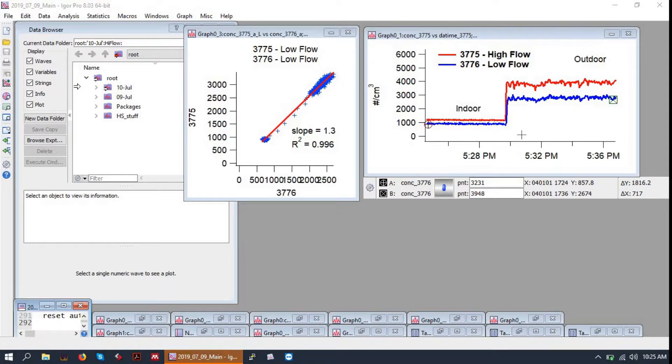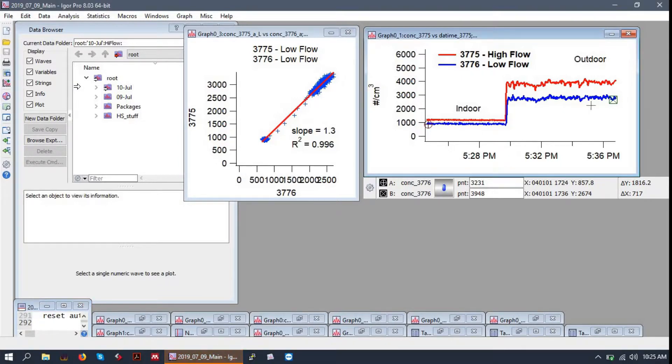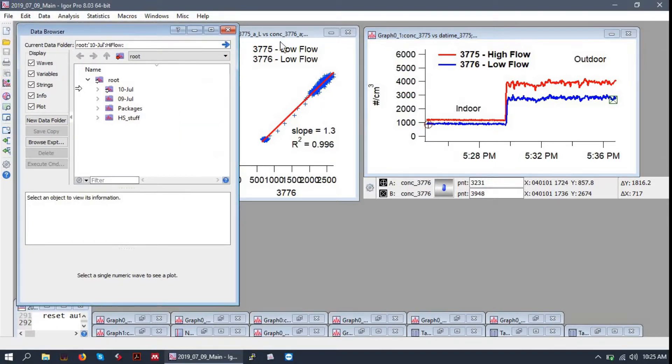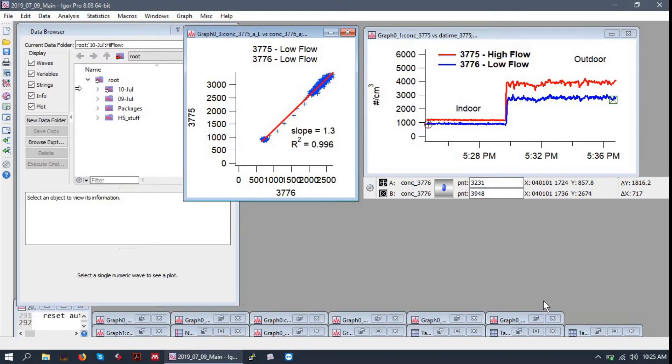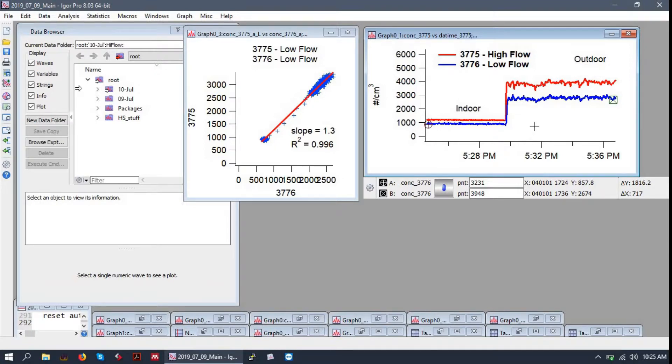So the experiment opens as I saved it last, and that includes having a time series, a scatter plot, and the data browser front and center with all the other windows minimized down below.